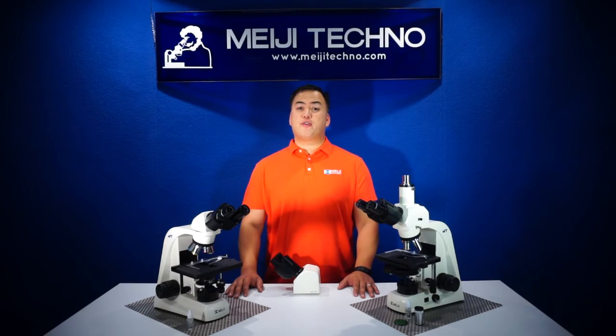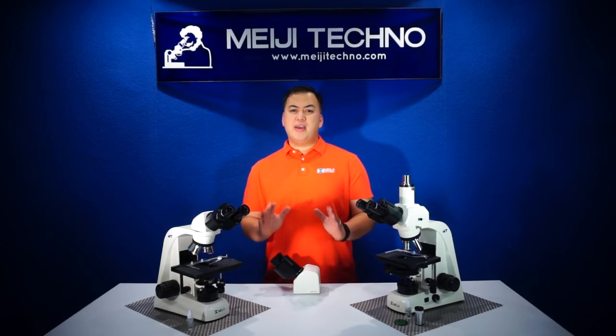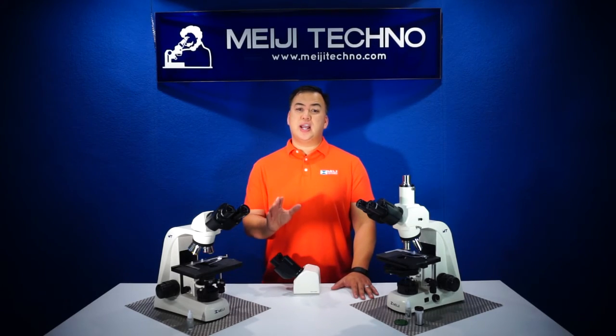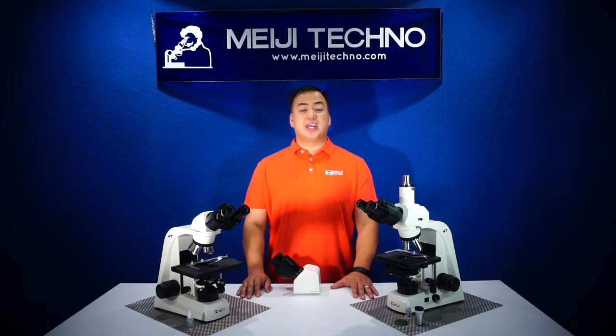The MT4000 series offers an outstanding range of features and optical performance, with an emphasis on a newly engineered high-performance Japanese optics based on Meiji Techno's infinity-corrected optical design.